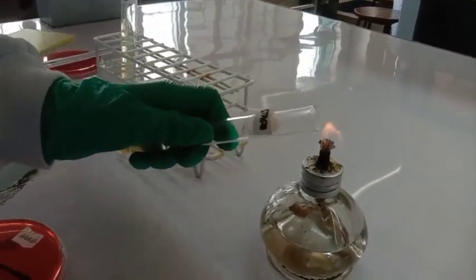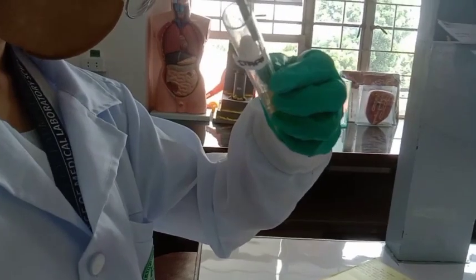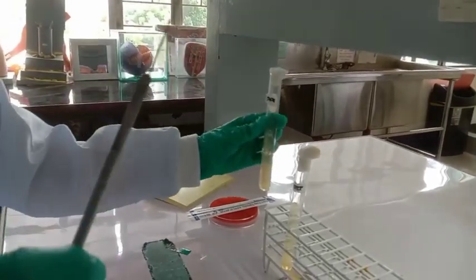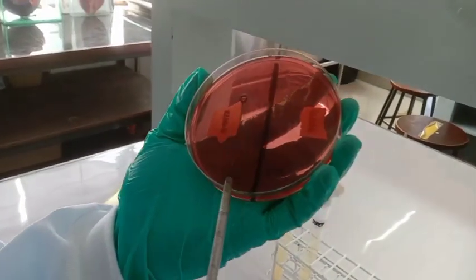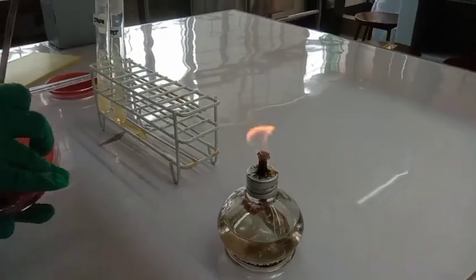While observing aseptic technique, get a colony of Streptococcus and streak the colony onto half of the MSA plate using a continuous streak.